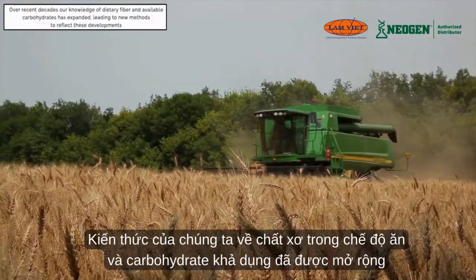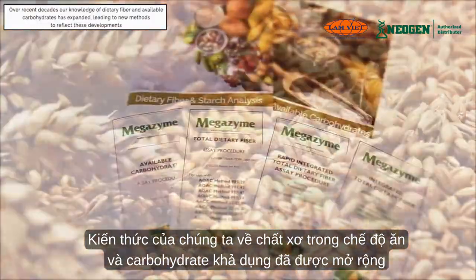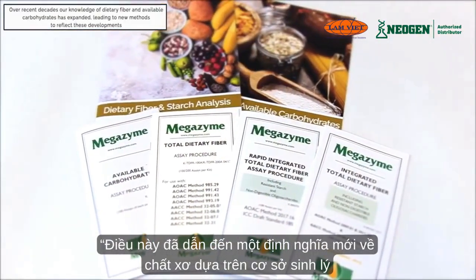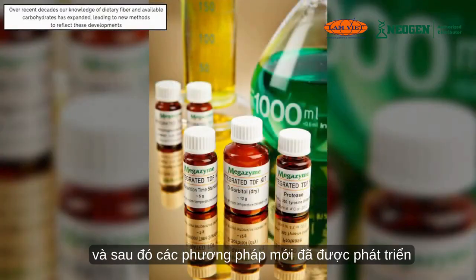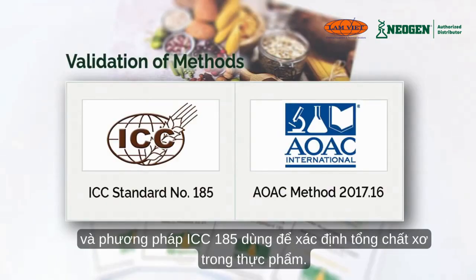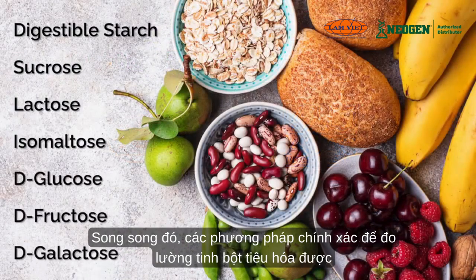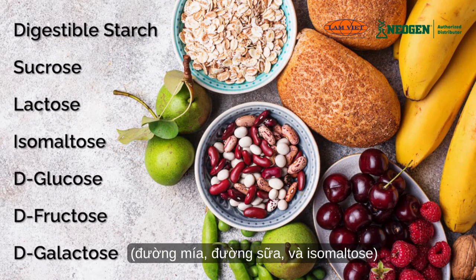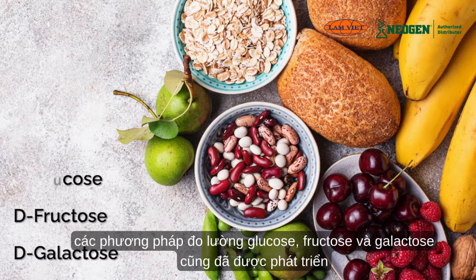Over recent decades, our knowledge of dietary fibre and available carbohydrates has expanded. This has led to a new physiological-based definition of dietary fibre, and subsequently new methodology has been developed, leading to AOAC method 2017.16 and ICC method 185 for total dietary fibre. In parallel, accurate methodology for the measurement of digestible starch, sucrose, lactose, isomaltose, glucose, fructose, and galactose has been developed.